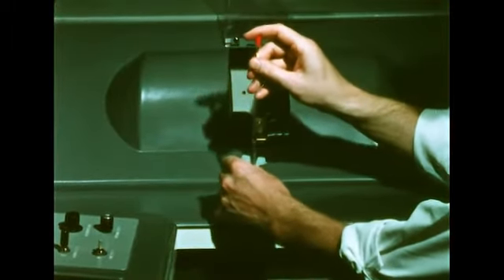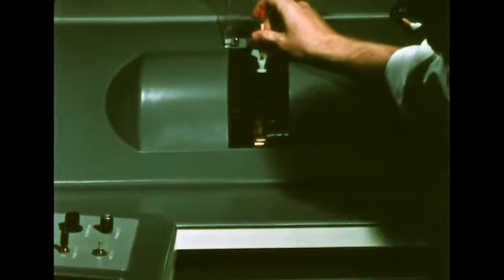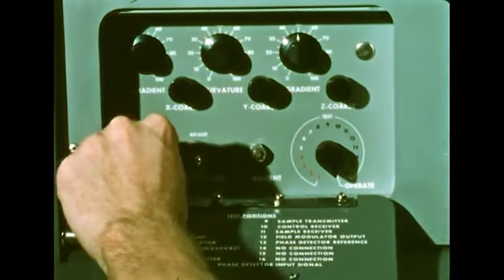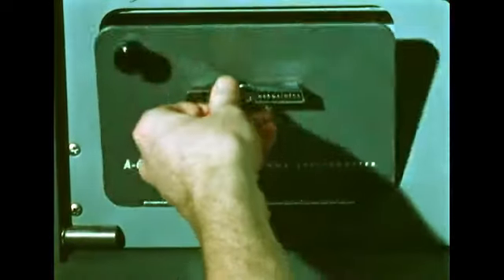The sample is placed in a glass tube and inserted in a small air turbine. The assembly is then placed between the poles of the magnet. An air jet is then turned on, which makes the sample spin to average the magnetic field in all parts.